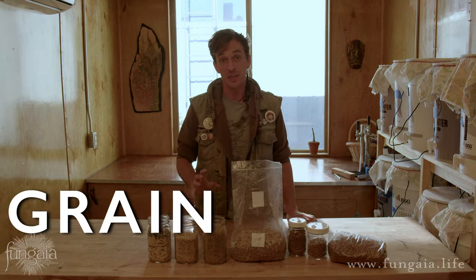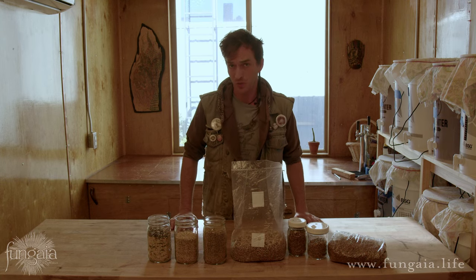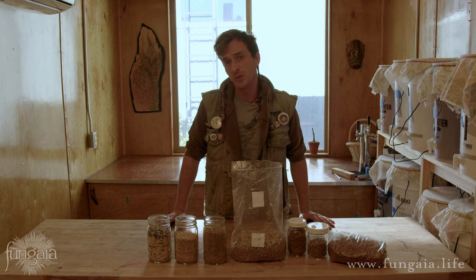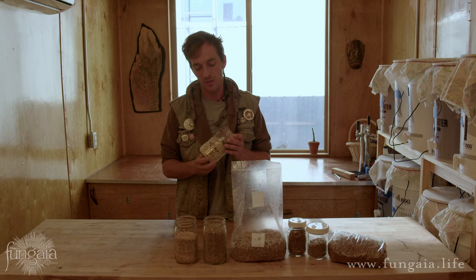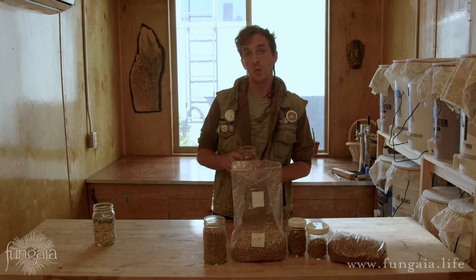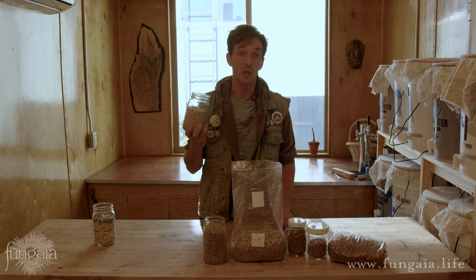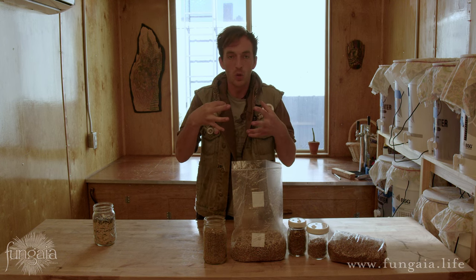Just about any whole unprocessed grain or seed will work for this process and it really comes down to personal preference. I encourage you to try working with a few different varieties. For a lot of people the biggest consideration is cost — that's probably why wild bird seed was in wide use in the early days of mushroom cultivation, but it's hard to work with consistently. What I'm seeing most people working with these days is either sorghum, also called milo, or millet. They're much smaller grains, which means the mycelium can enfold the grain much more rapidly, giving you faster colonization rates.